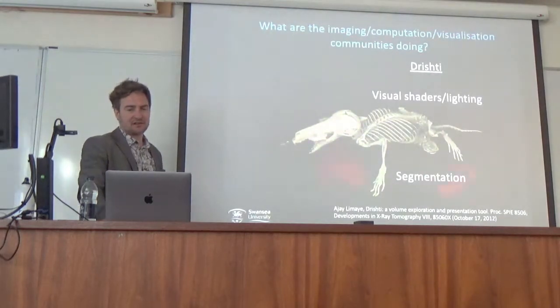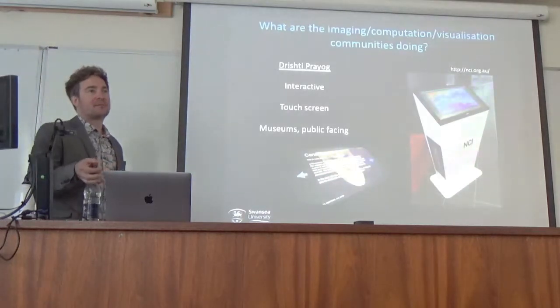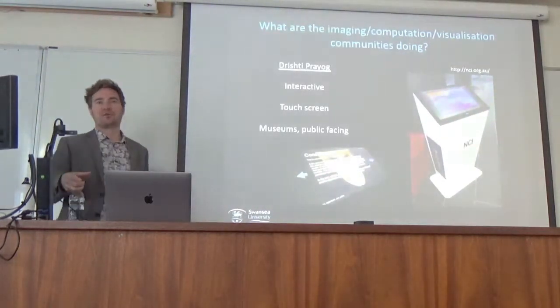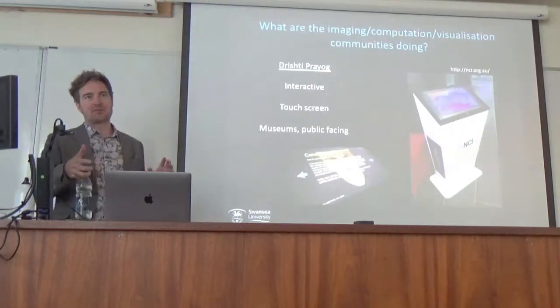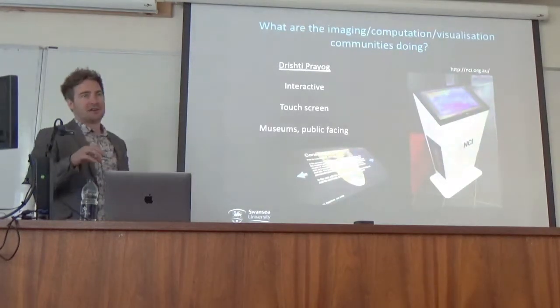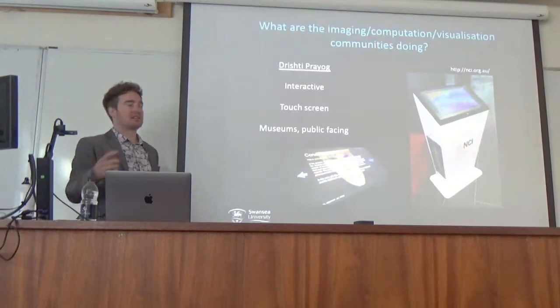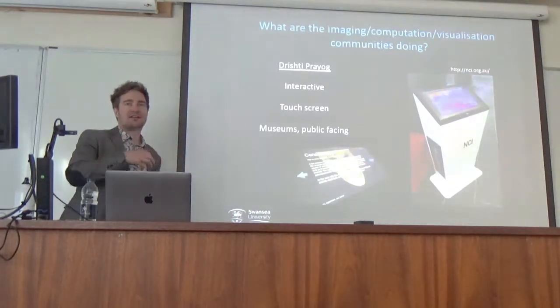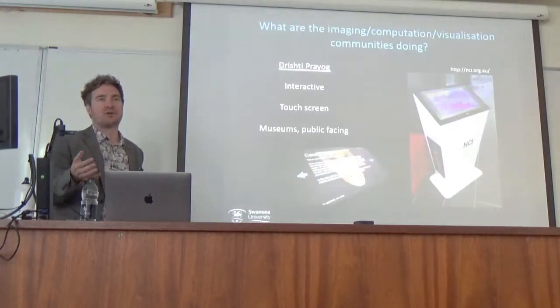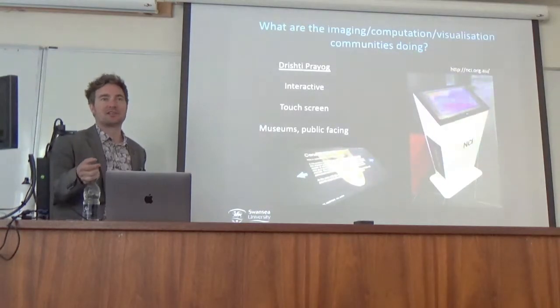And another thing, recognizing that these outputs are highly visual, the Drishti developers have created Drishti Prayog, which is an interactive touchscreen version of their software. Stripped down, it's usually created from your output. So once you've done a lot of work in Drishti, you've modified your transfer functions, you've maybe done some segmentation, Drishti Prayog is where you can then, in a slightly different version of the software, have the public interacting with it. Or when I say the public, anyone who isn't yourself is the public, usually.